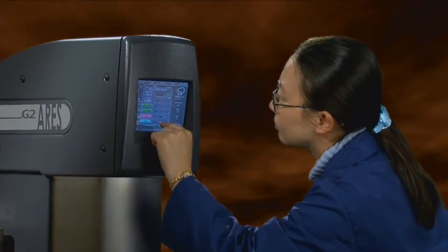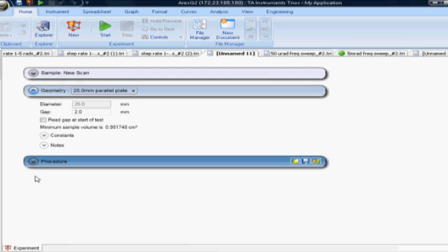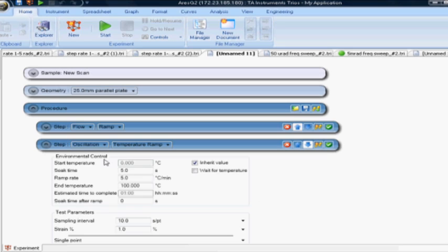Harnessing the power of the new ARES G2 requires equally powerful new software. Trios is an intuitive software interface offering an unprecedented level of testing freedom.